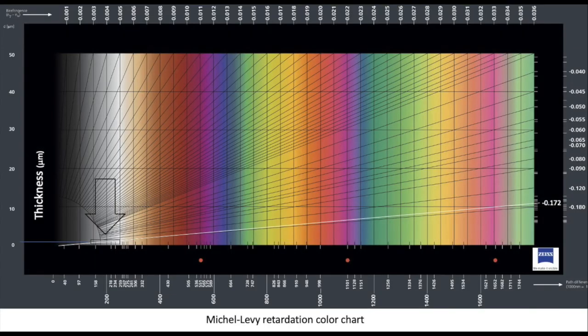The most common retardation color, from here on we'll just refer to it as color, of our calcareous nanofossils is the first order white. Due to the high value of the birefringence of calcite, this color is obtained with very small and thin crystals, less than 2 microns thick. Yellow colors indicate thicker crystals that may attain 2 to 3 microns. Orange-red up to 4 and blue up to 5 microns.